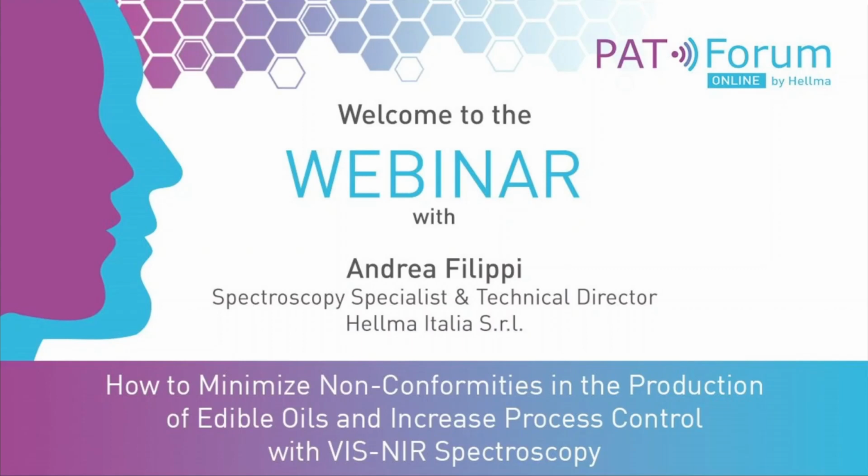My guest today is spectroscopy specialist Andrea Filippi on the topic how to minimize non-conformities in the production of edible oils and increase process control with VIS-NIR spectroscopy.